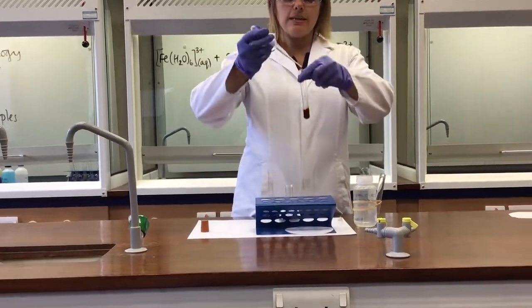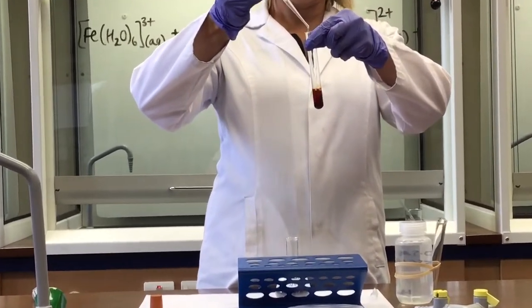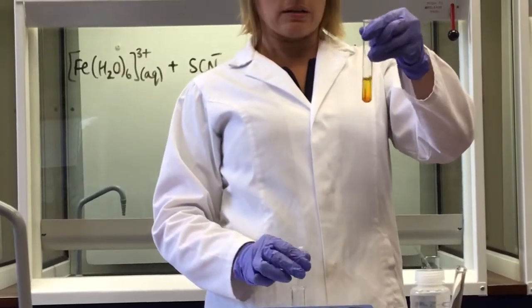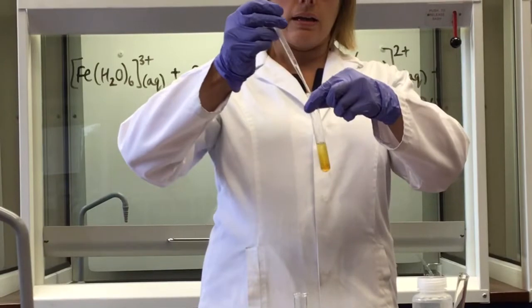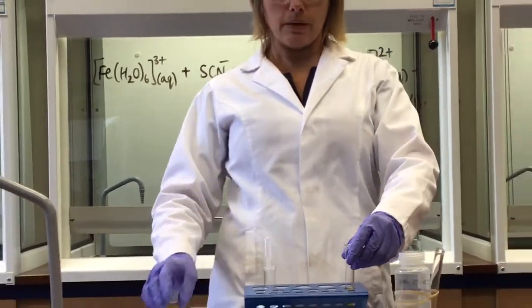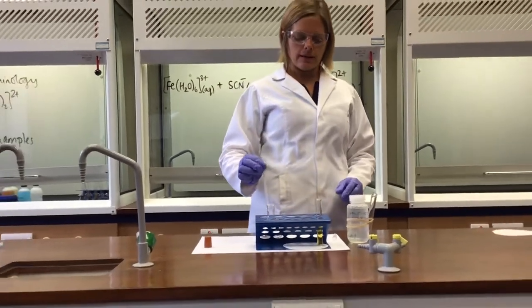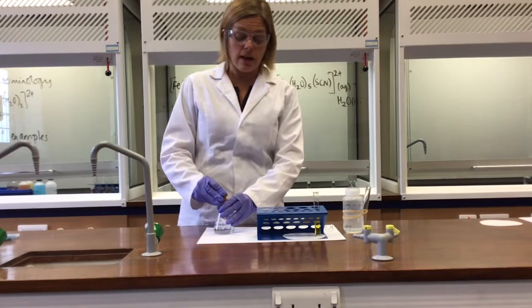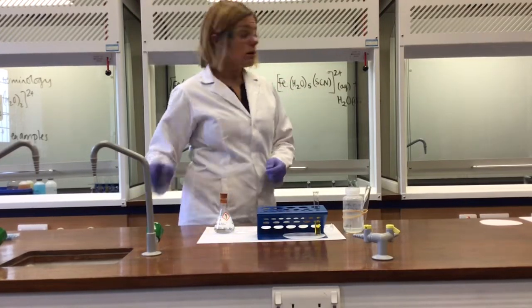So if I take some EDTA, that colourless solution, and add it now to that blood red solution, like so, give it a bit of a shake, and add a drop more, hopefully what you can see now is that the blood red solution has completely gone. And the colour of the solution is back closer to the Fe3+ that it started with.